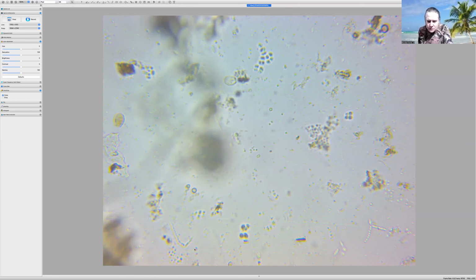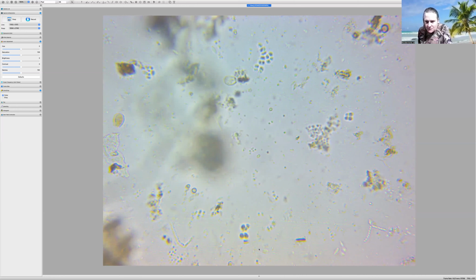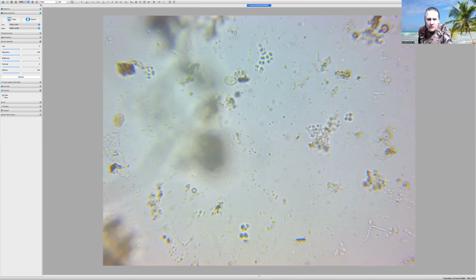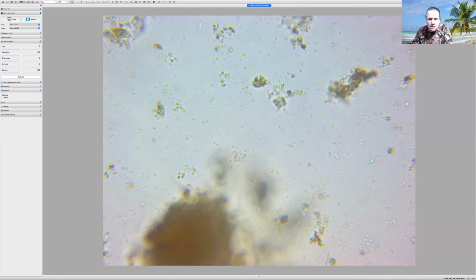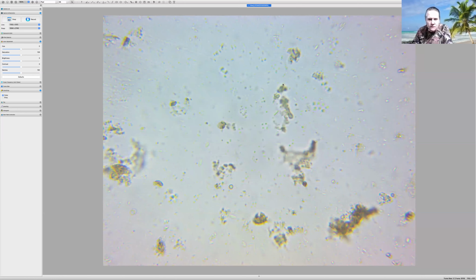They're too big, so to me they are a form of fungi spore. So right here, 1, 2, 3, we've got flagellates everywhere. Testate amoebae, flagellate. Everywhere you look, you're going to see flagellate. But I'm wanting to see if I can find you the rotifers, which are low oxygen.